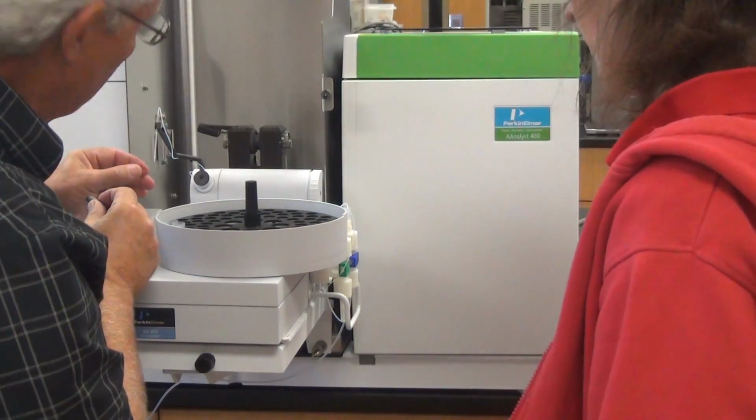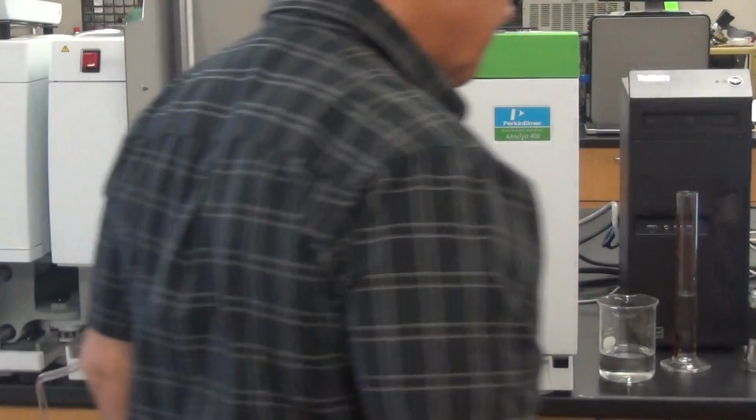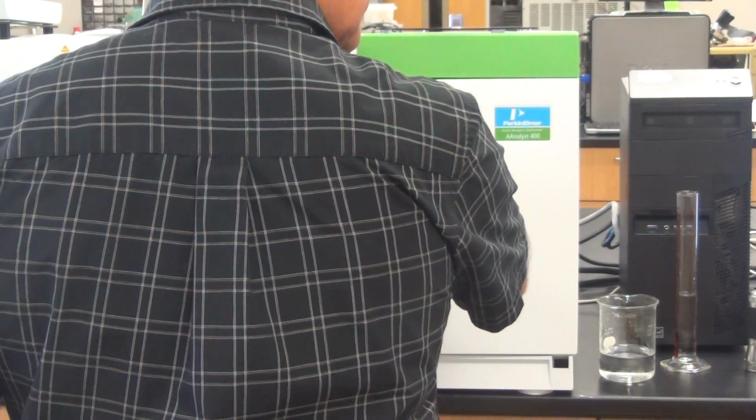And you always want a bevel on it because the bevel helps break the surface tension. And then once you do the tip, you have to line it again because you might have bent it. So that's positions. You've got position in the sample, you've got position in the furnace, and you control them both with this little stepper wheel on the end of the arm.